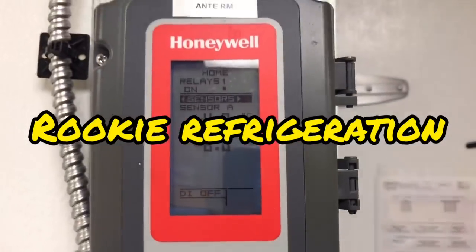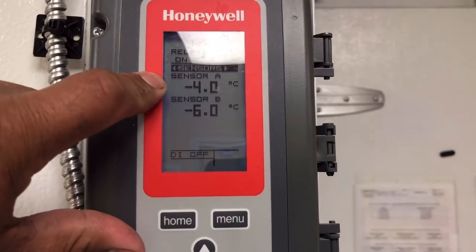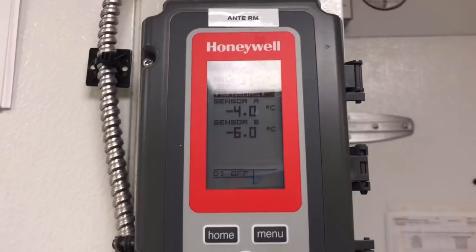Today we have a freezer that's running about 25 degrees. I've got my mask on, so sorry if you can't hear me, but we're going to go inside and check it out.